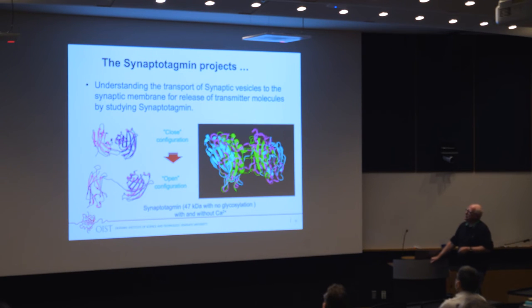All right. So it turns out that crystallographic procedures have been used to solve the two when there is a lot of calcium, and another version where there is little calcium. But these are only two different conformations, and the question is which work and which doesn't work, or how much in between can it be to work? That you can't see. With crystallography, they've been able to pinpoint two versions here. Not yet, though, with SPA, because it's not big enough.